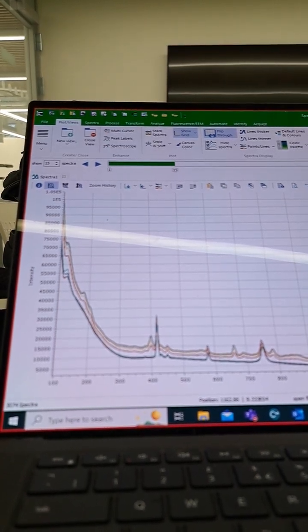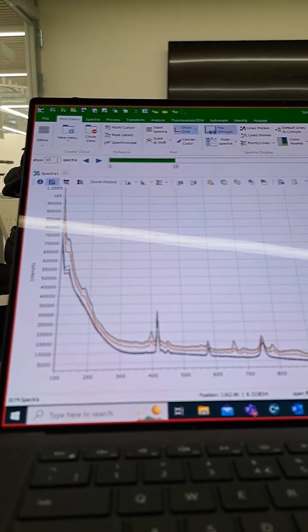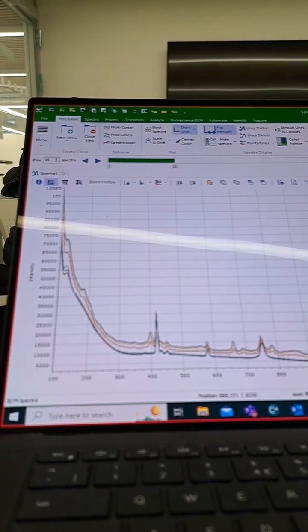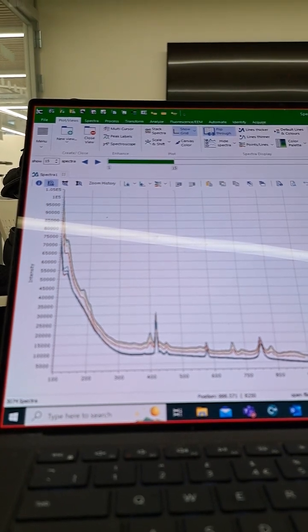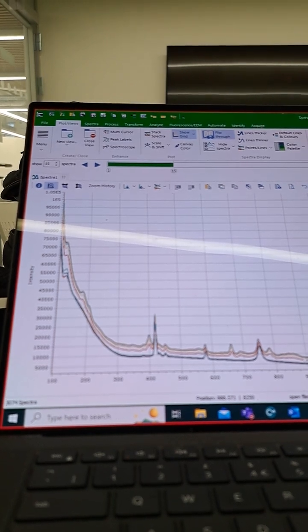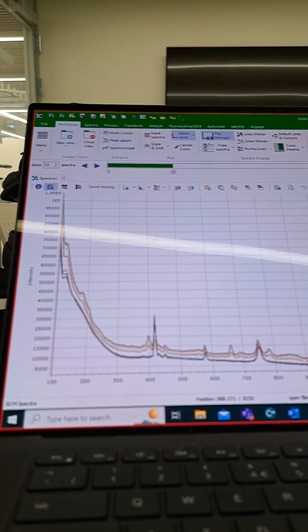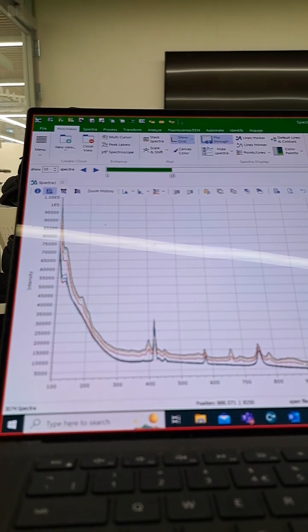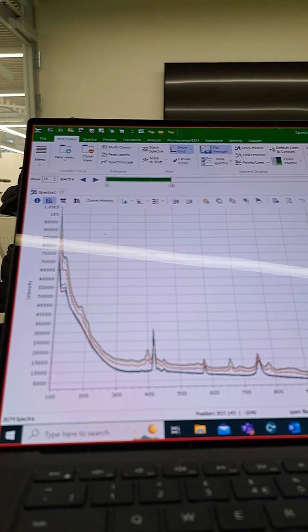No, like if you were monitoring it continuously, how do they calculate the data? Because here I can't find the time. So I checked from my method how many spectras I'm getting in 1 minute. Based on that, I calculated that okay, this spectra correlates to after 10 hours or after 20 hours roughly. Would that be? Sorry, what number would that be for 20 hours?